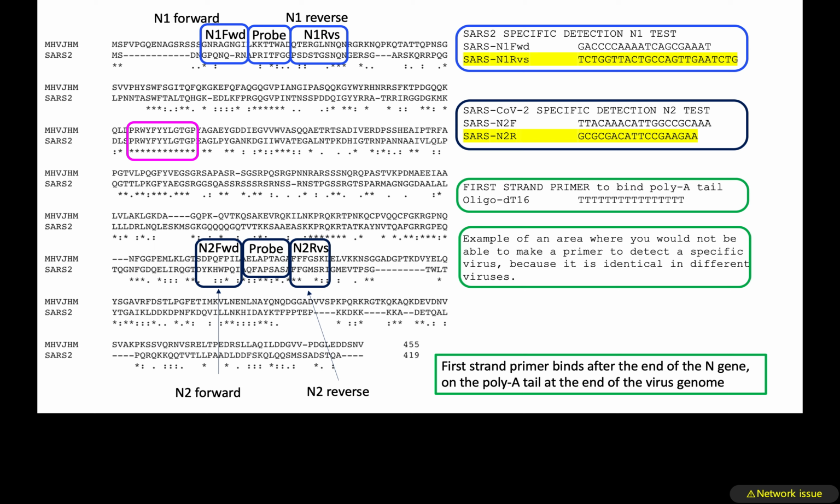And this is going to be as sensitive as PCR. So you can routinely pick up 50 copies or 100 copies or more of the virus. And that is very helpful when you're trying to track down a disease, for example. But like I said, there are lots of other ways you can use this. You can look at the metabolism of a cell, what genes are being expressed at a particular time. You can look at cancer. You can see which genes the cancer cell is expressing. That can tell you if this cancer cell is like a lung cell that has moved out of the lung and is, like, lung cancer that is lodged in a different tissue. Helps tell you how you want to treat this thing.